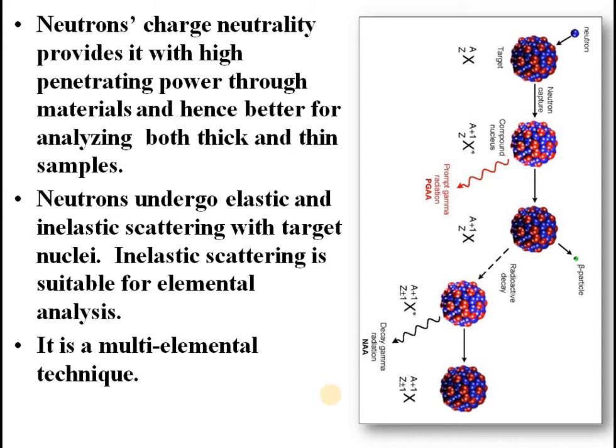This is an important feature of any ideal elemental analysis technique, as we outlined in module 1. It is also highly sensitive. Keep in mind, it is highly sensitive in the sense that it can identify the element of interest even if it is present in picograms or nanograms. Even at low levels, picograms can be identified.